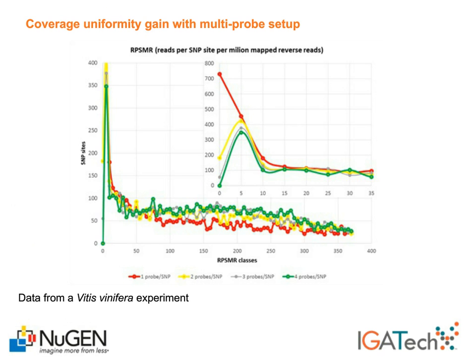We also need to note that this was a first-run greedy experiment, which means that we wanted to squeeze the system as much as possible by just using a single probe per SNP site, which was not the original idea of this system.